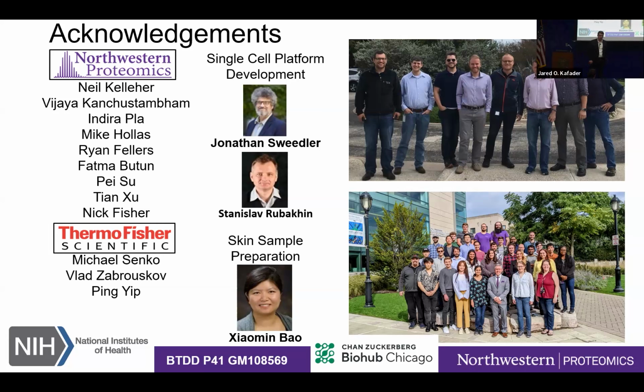Yeah, especially for some of our top-down work, we're very sensitive to adduct salts, and that also leads to ion suppression. So we've started increasing washing protocols and working through a lot of that. We just need to get better at cleaning our sample and funneling all the ions directly into the mass spectrometer. It's probably just transfer. It's low abundance to begin with, and then transferring and getting the ions out and up and in. It's just where we're currently limited. There should be significantly more proteoforms present. Right, in all the other talks we've seen, there's thousands.